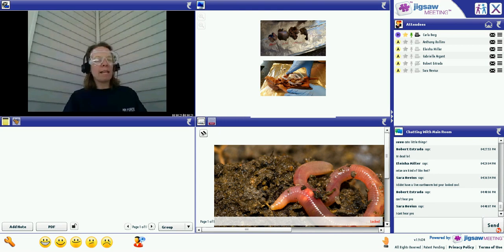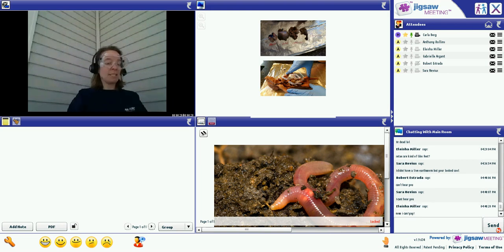Sorry, guys. I'm going to wear gloves while I dissect. I suggest that you do as well. It just will help with the smell on your hands.